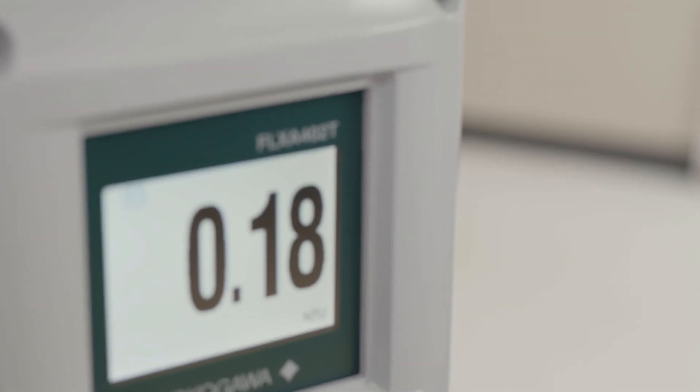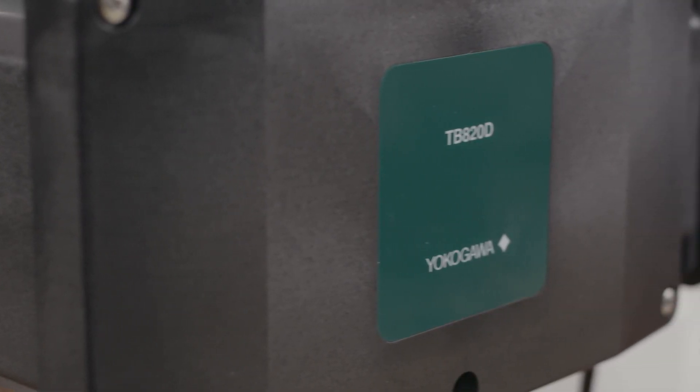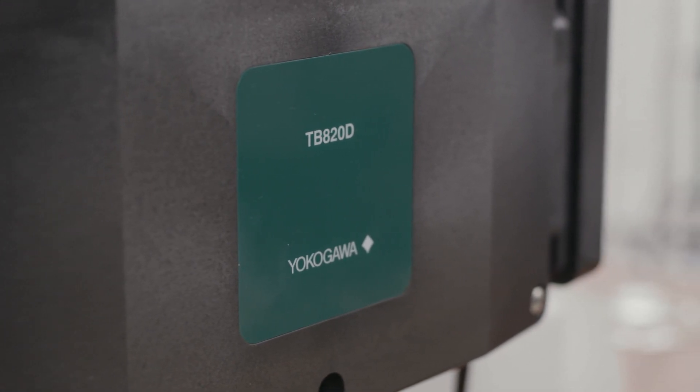For lower than 40 NTU, which is going to be the vast majority of your applications, we ask that you do a light on with a zero water — a water that has a value of zero NTU. So it's a very filtered water.